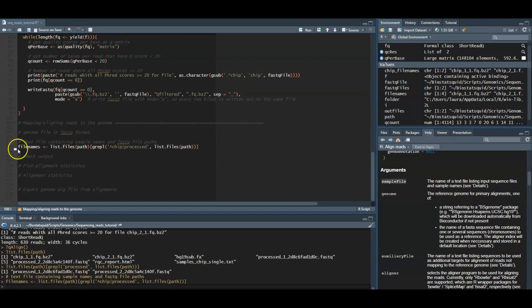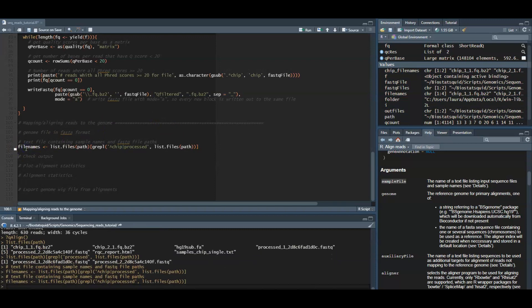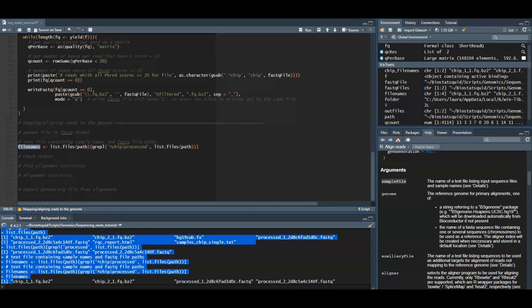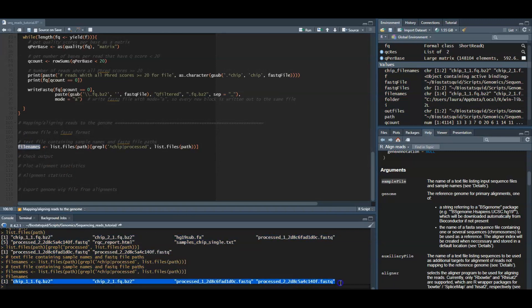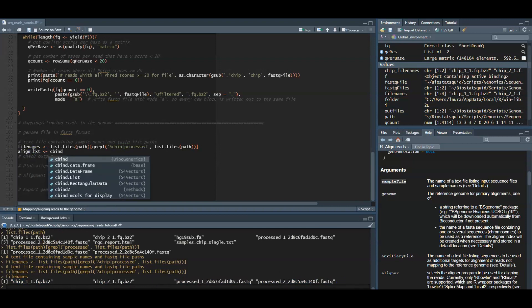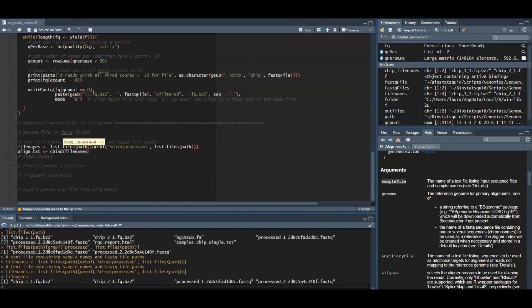So we will do this with the grapple function. And now we have our filenames. So we have four filenames. And now we can create sample names for them. I will just use this rep function to create sample one, sample two, sample three, sample four.